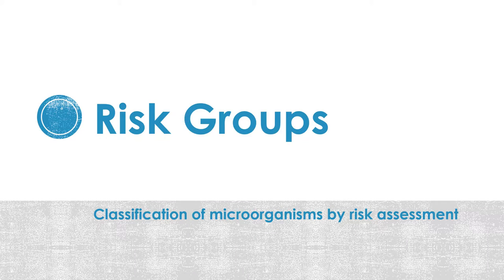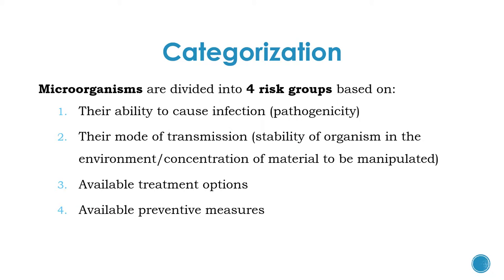Risk groups: this is the classification of microorganisms based on risk assessment. Microorganisms are categorized into four risk groups based on their pathogenicity or their ability to cause infection to the person handling the organism, their mode of transmission from one person to another and to the community, the stability of the organism in the environment and the concentration of material, whether treatment options are available, and whether preventive measures like vaccines or chemoprophylaxis are available.